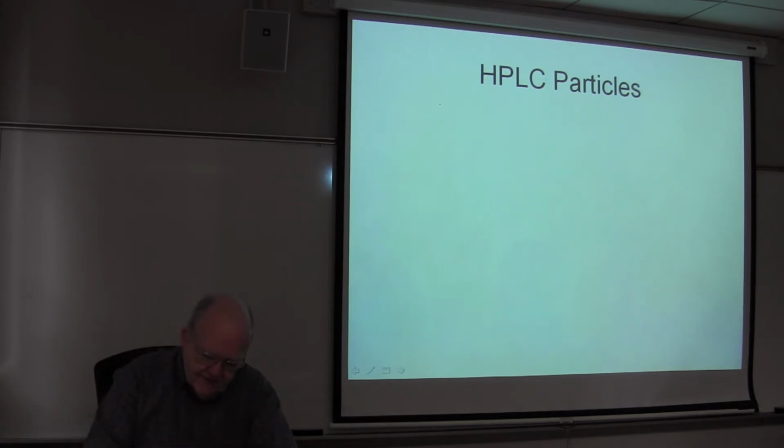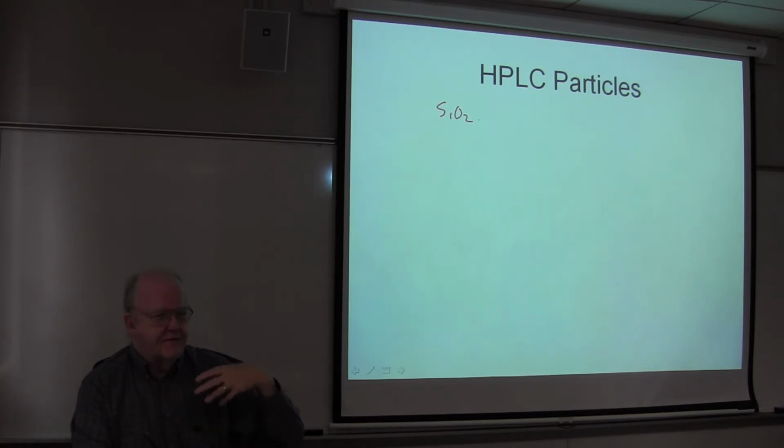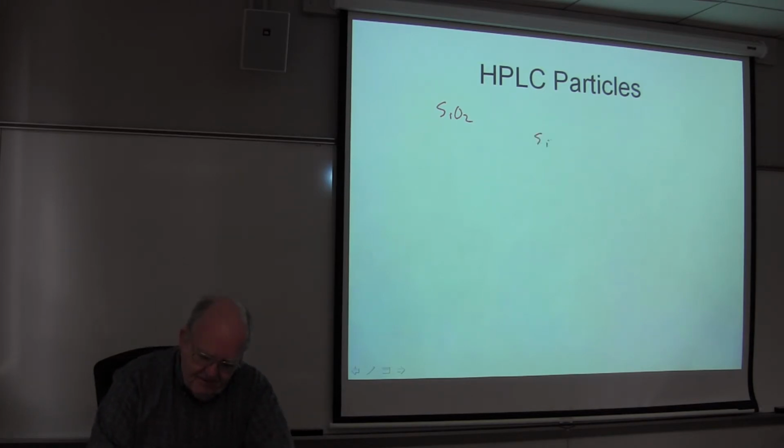The most common particle used is silica, SiO2. Unfortunately, the interface between a piece of silica and a solvent is not SiO2. At the surface of all silica, the surface is not SiO2, the surface is loaded with stuff like that.